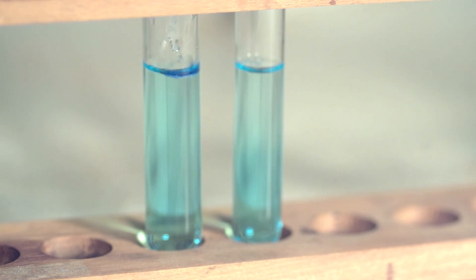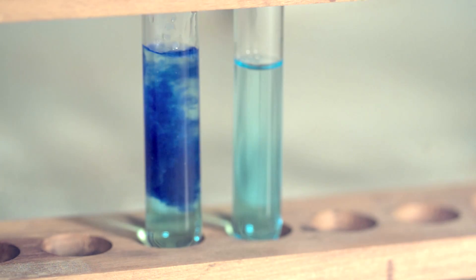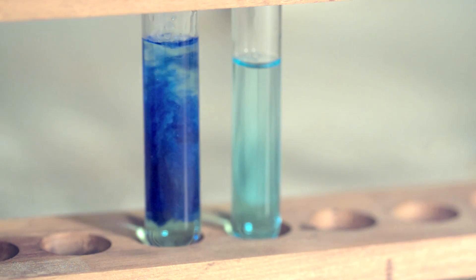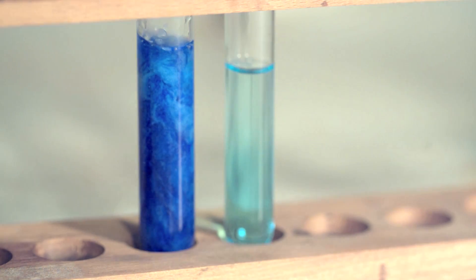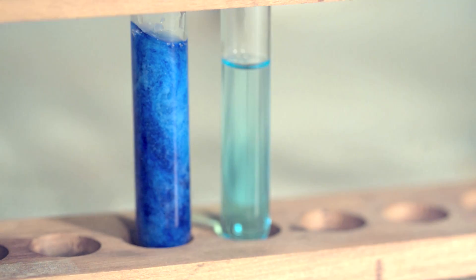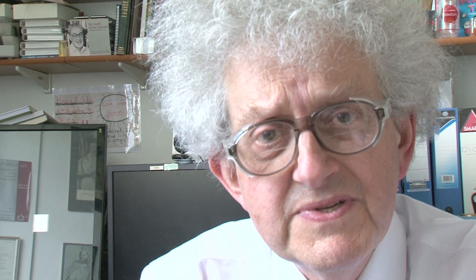The reaction of copper with ammonia is quite a well-known reaction, and often students and school children come across it quite early on in their career. It's a reaction which gives both a precipitate and then a colour change.